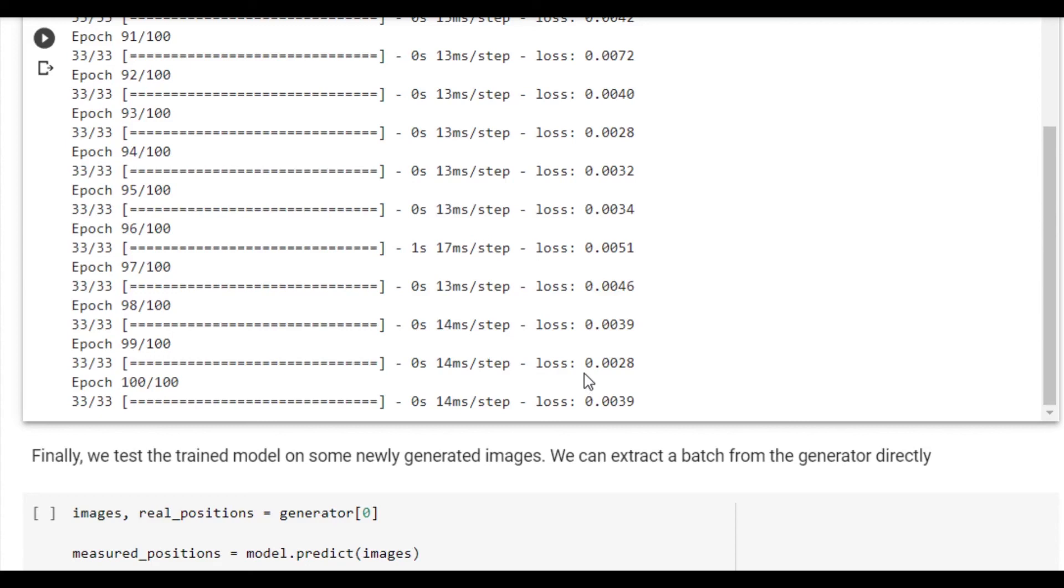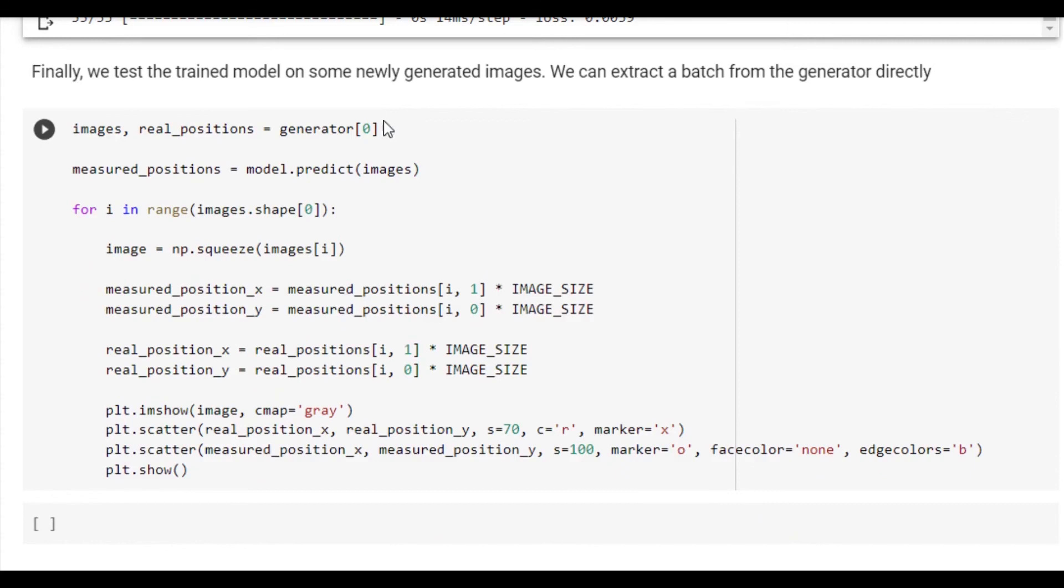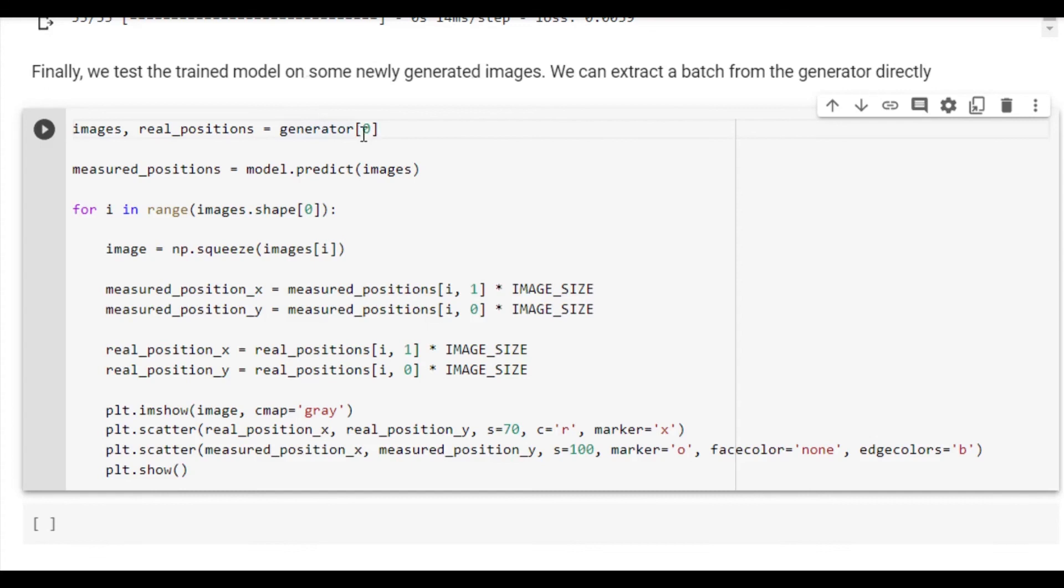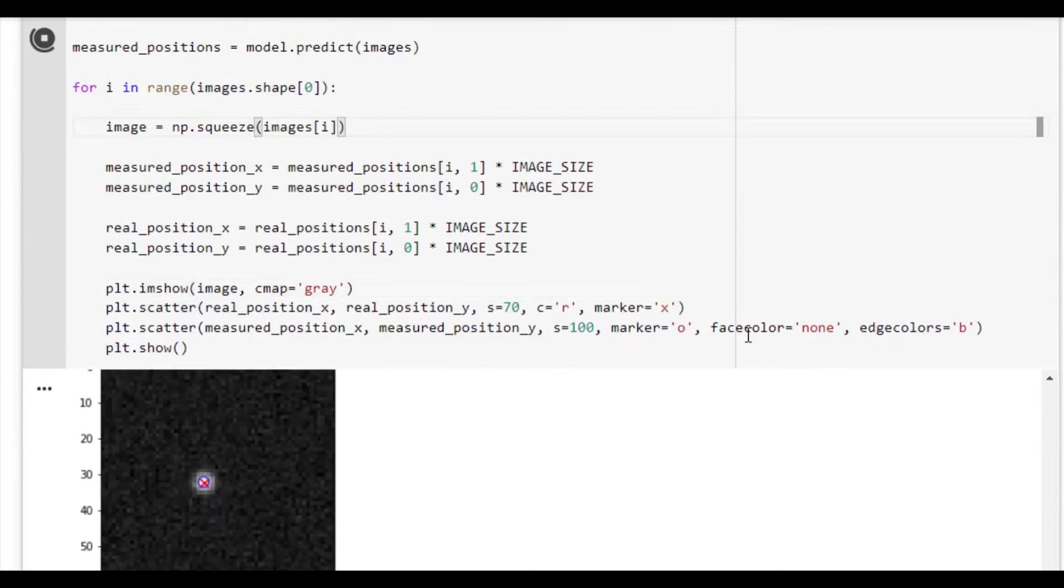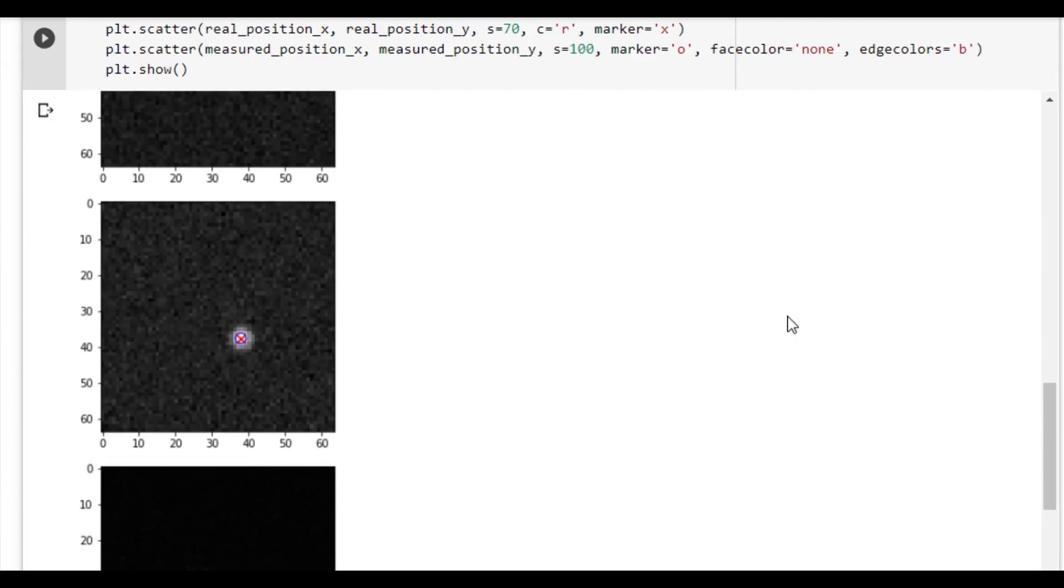Now that the network has finished training, we can evaluate its performance on some unseen data. We extract a batch from the generator by calling generator. From this we extract the images and the position of the particle within each of those images. We'll also calculate a measured position by having the model predict on those images. We use a for loop to iterate through all of the images and extract the in-image measured position by multiplying the values by the size of the image. We do the same thing for the real positions. Finally, we show the images. We scatter the real positions using a cross and the measured positions using a circle. We see that the tracking is not yet absolutely perfect, but it is definitely getting there. A few more minutes of training should probably do the trick.